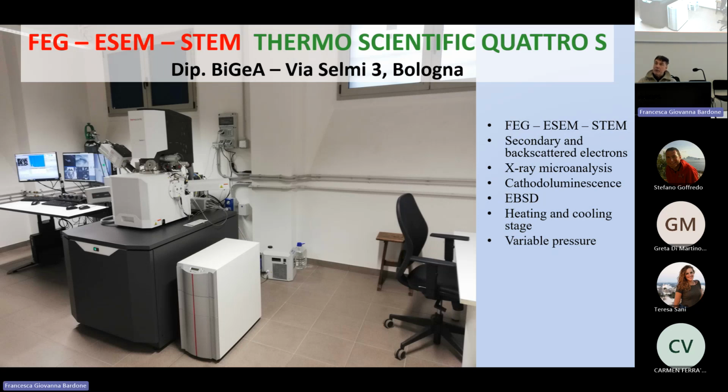You can change the temperature. But for the biological means, you can observe the biological tissue without any alteration. So this is the usefulness of this. But during the lecture, you will see many other applications. But the most important is that the biological tissue can be observed without any preparation and without any modification during the observation.